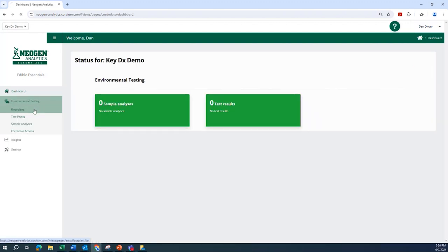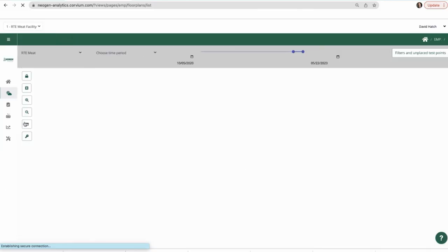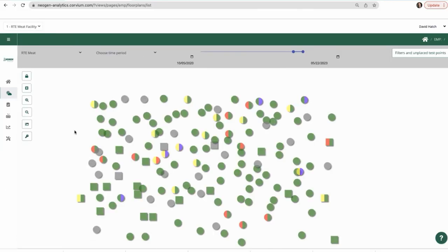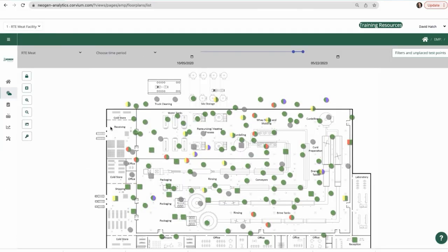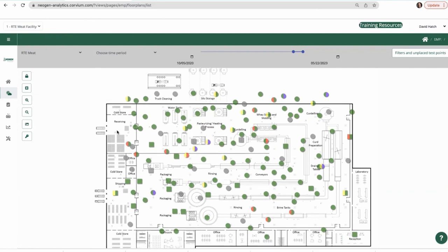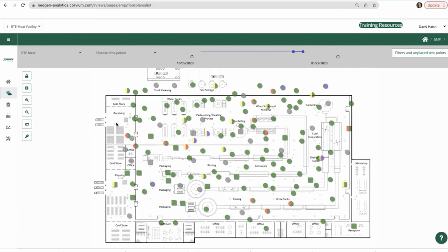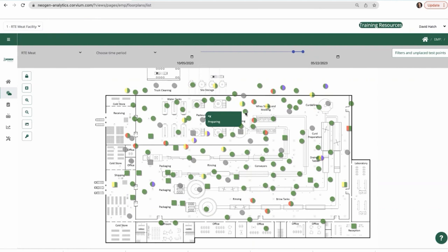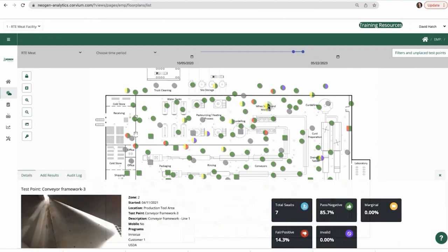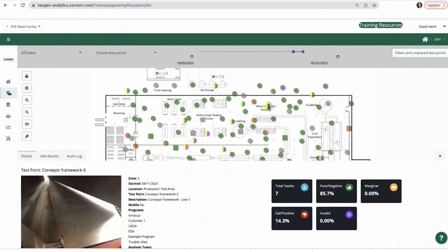Easily view all swabbing locations by viewing the floor plan, located under the Environmental Testing tab from the left hand menu. All swabbing locations or test points are visible with a color identifier that, at a glance, tells you the most recent testing result, as well as historical performance of that location.